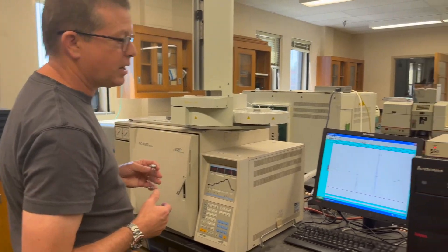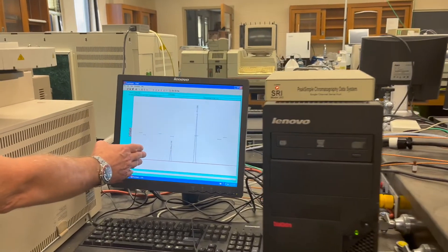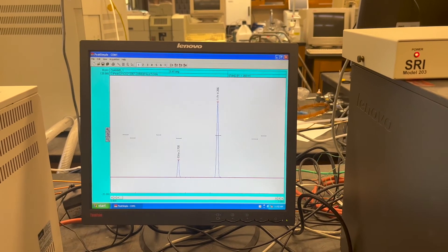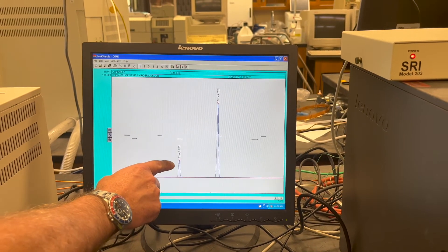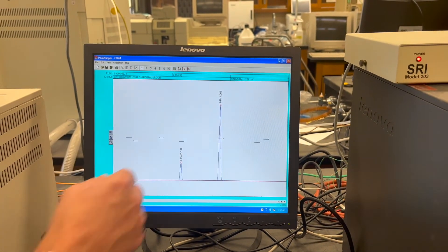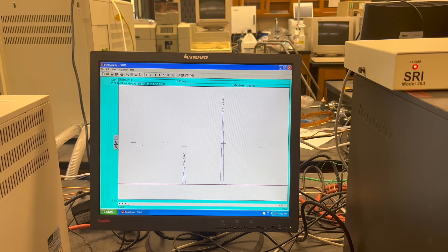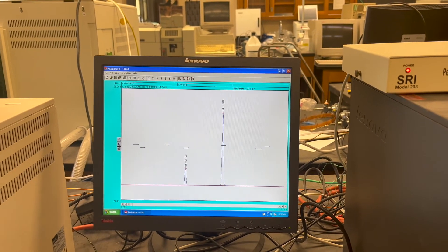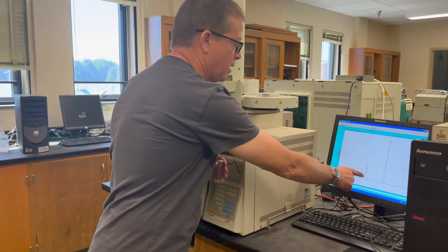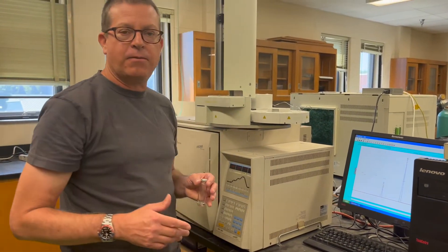Ultimately what you end up getting is what we call a gas chromatogram, which looks something like this. You'll see we have two peaks: one for the ethanol, which is what we're interested in, and another alcohol that we put in as a standard for comparisons — you can see how the two alcohols are separated from each other. We look at the area under the ethanol peak, and from that we can determine the concentration of ethanol in the kombucha sample. That's how this instrument works.